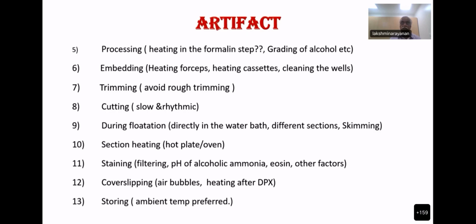And sometimes, in the colder season now, yes, we were talking, in Delhi it is nearly 3 degrees, 4 degrees. So as soon as you take out the cassette from the machine, it will be very much solidified. So heating the cassettes is a quite practical way of doing it, but the person who is doing it should be very sincere that the heating should not cross more than 60. Then after embedding, if the embedding machine is there, then cleaning the well is important, otherwise carryover chances are there.